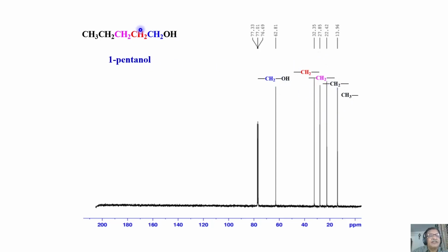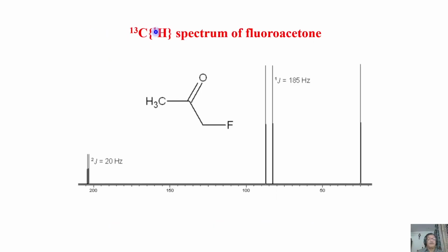You can utilize the knowledge of the proton chemical shifts, and then we can do that. Okay, we will come to that later. We knew how to assign protons based on this being a triplet, this a quartet, this a triplet of triplets. All those things we knew. Same way, once you assign the proton spectrum, use the proton chemical shift knowledge, and we can make the assignment of the carbon. We'll do that when we come to the two-dimensional HSQC spectrum.